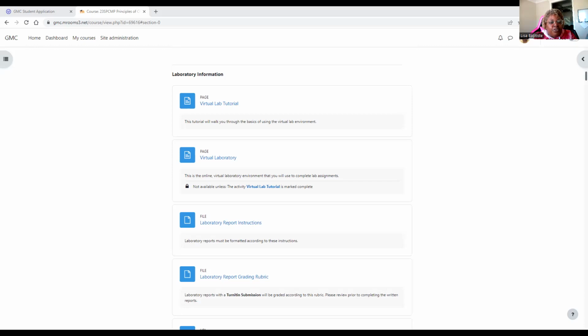So once it's transferred, we see that our volume increased. So we want to write down what our new volume is. And so our new volume, it looks like it's above the 4.8, but not quite at 5. So say we're going to say it's 4.83. Okay. So say we do a volume of 4.83. So that's the volume that it increased to once we added the solid.